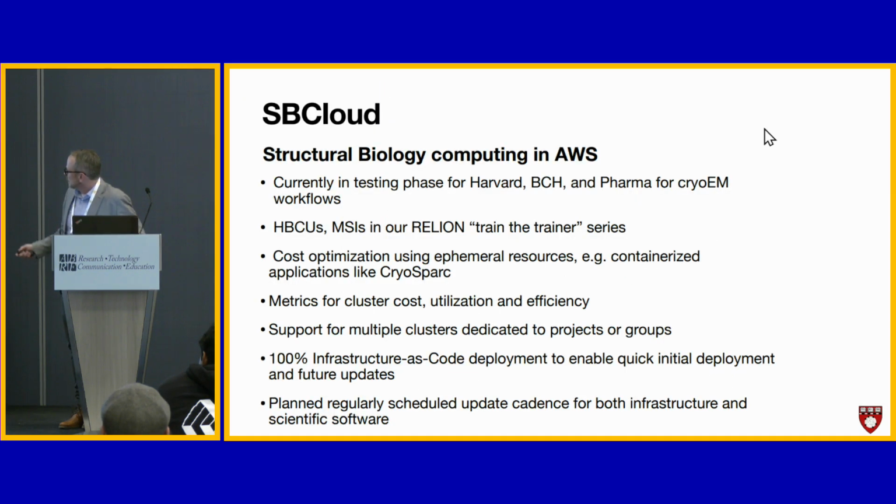Right, so we're running this at Harvard, BCH, and at some local pharma companies in Boston. We're also using this for this train the trainer that I mentioned earlier. We're building out this RELION tutorial in this platform. So we're bringing in PIs from historically black colleges and minority serving institutions, and they can learn RELION in this shared computing environment.